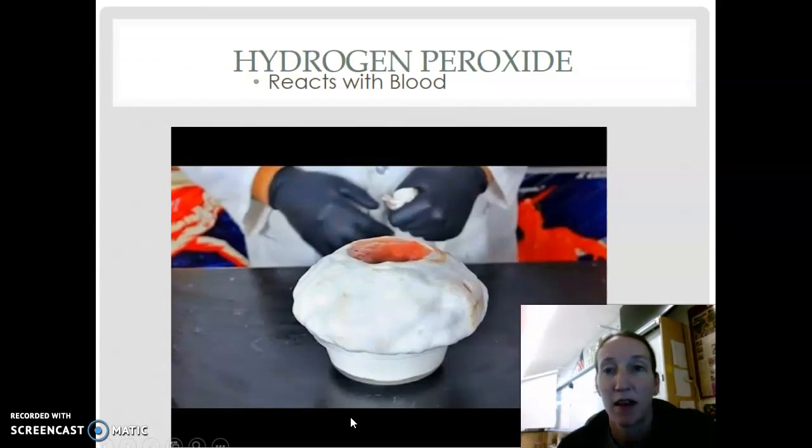Okay, next thing I want to talk about is hydrogen peroxide, and this is something you use in your house. It is a cleaner. And hydrogen peroxide, once again, works with the iron, and it creates the white bubble foam. It's creating oxygen and water, and that's just a bunch of oxygen gas that's here.